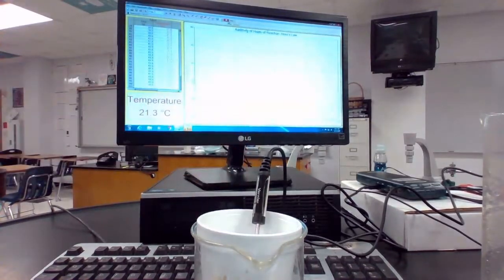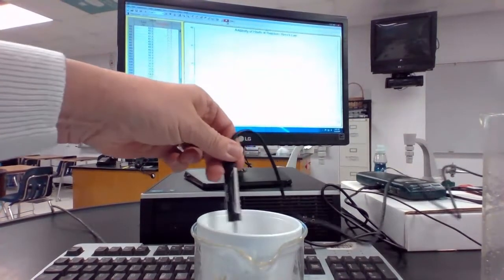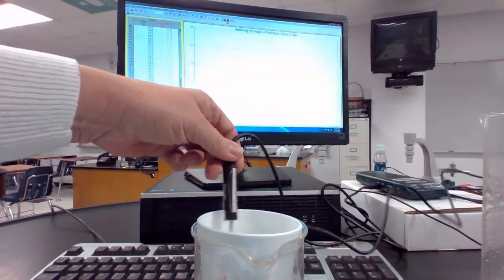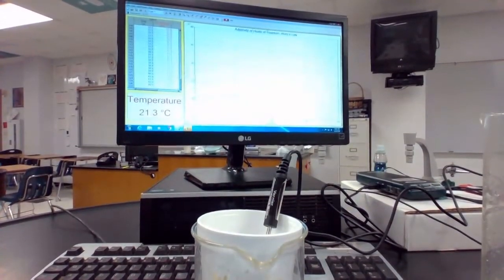We're going to let it sit and make sure that it does not have any higher temperature. Everything is already dissolved in here. Oh, I do see a few more particles in the bottom here, just making sure. It doesn't look like much, but let me change the scale here so you can see it. There's our scale, and it is plateauing out here at the end, and we're waiting for it to do that. So since our plateau is relatively flat now, I'm going to change the scale one more time.